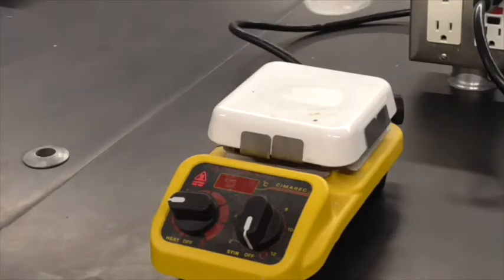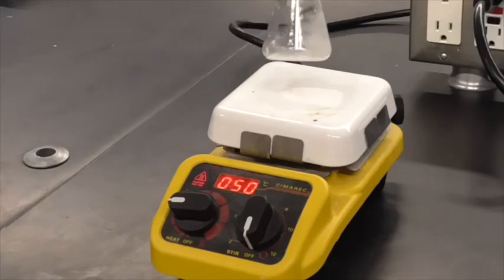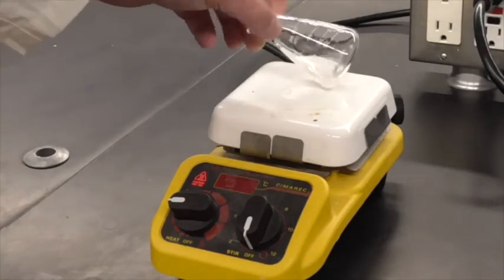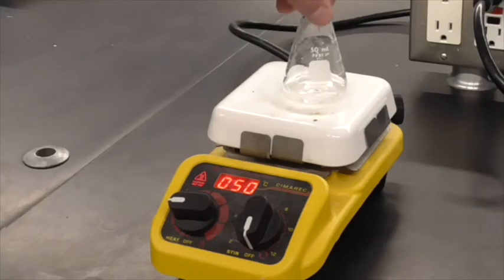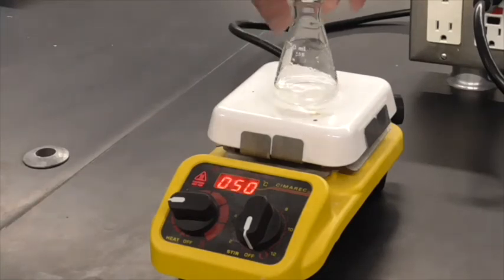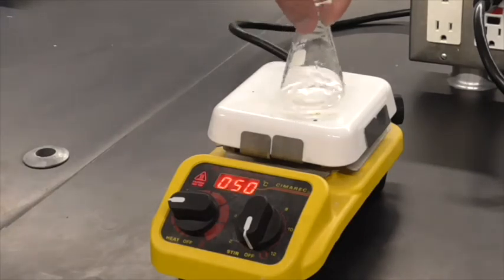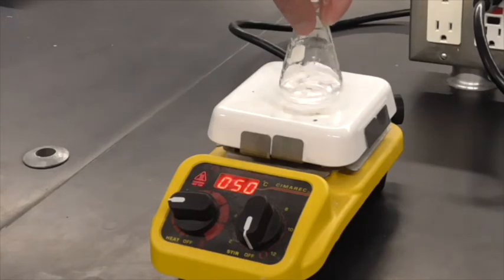So you can see already most of the crystals are dissolved, and I'm probably starting to form some aspirin. And aspirin is not soluble in this. We should start seeing crystals at some point. So I'm just going to let it heat a little bit longer and swirl it around a little bit here.